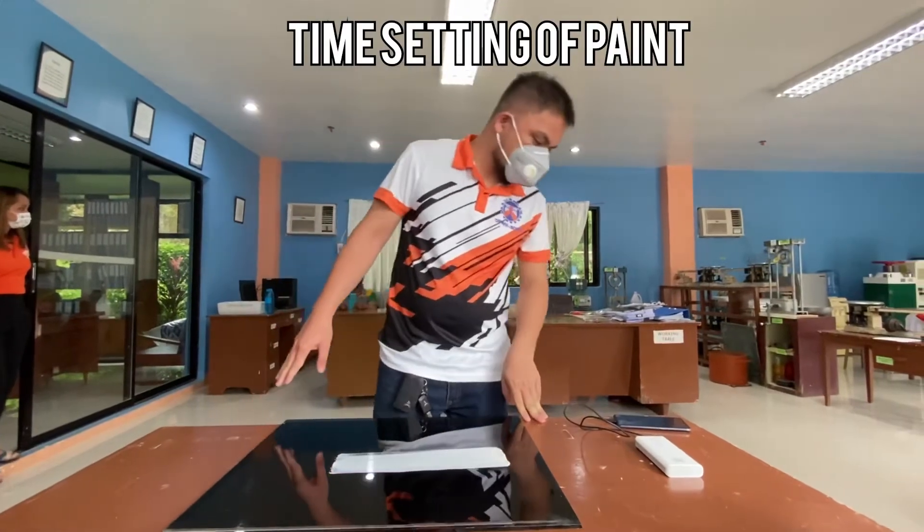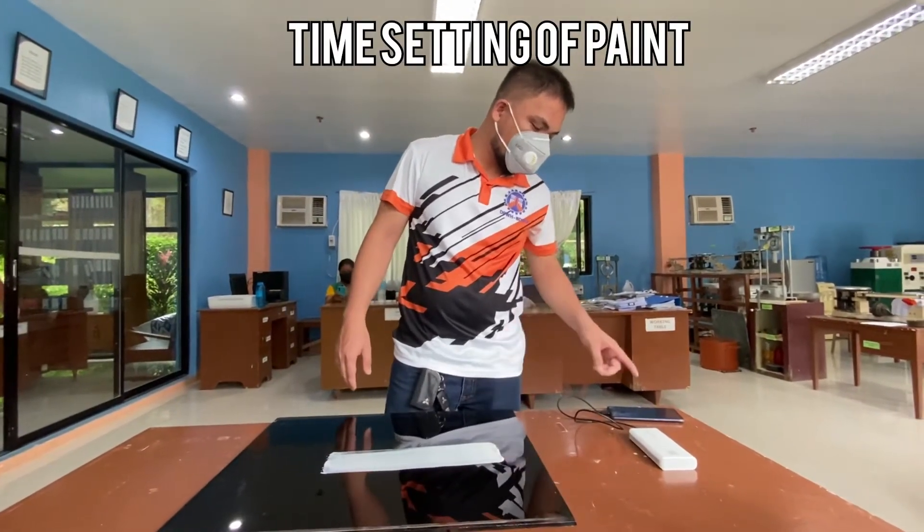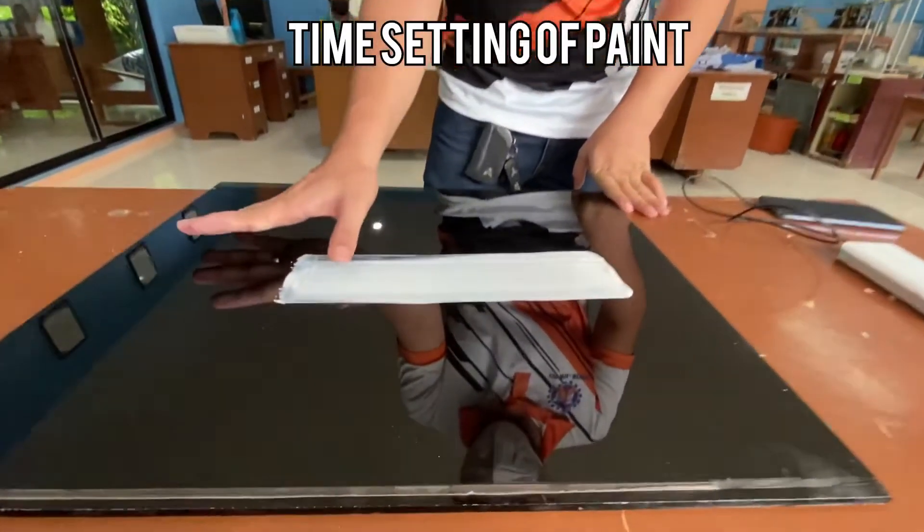The time check is after one hour and two minutes. I'll check again to see if it is in set-to-touch condition now.